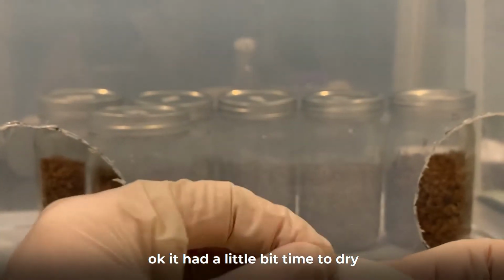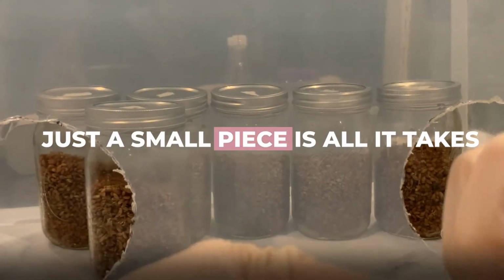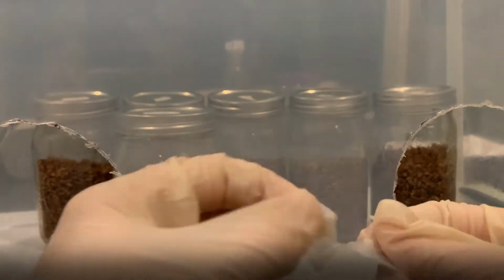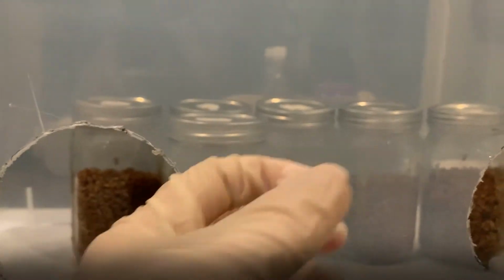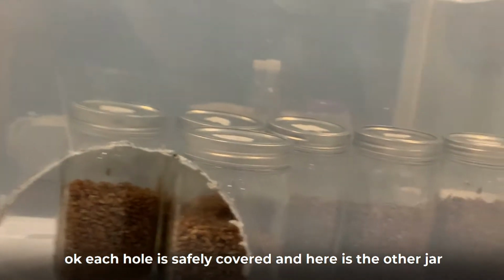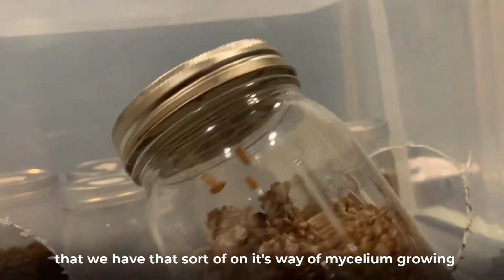Okay, now it's had a little bit of time to dry. Let's get those holes covered. Okay, each hole is safely covered. And here's the other jar that we have that's sort of on its way with mycelium growing.